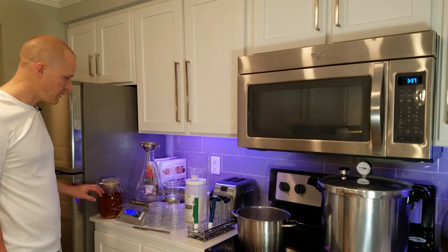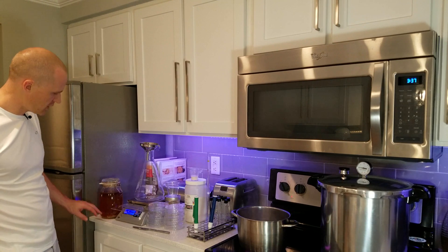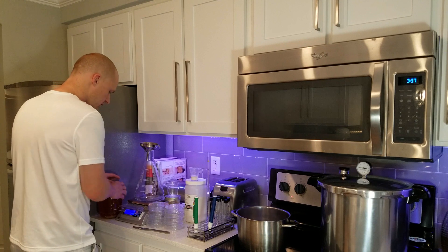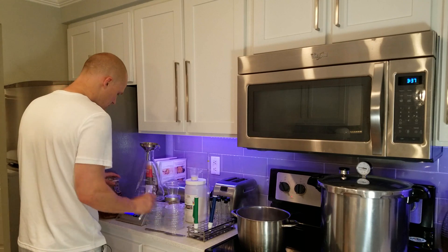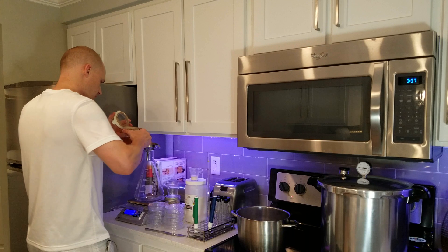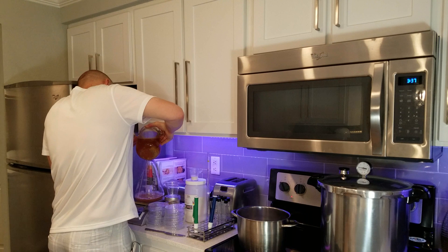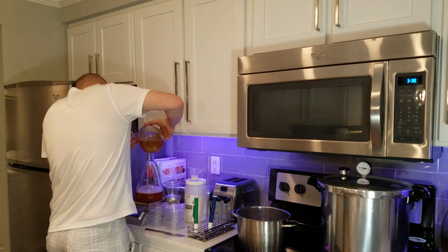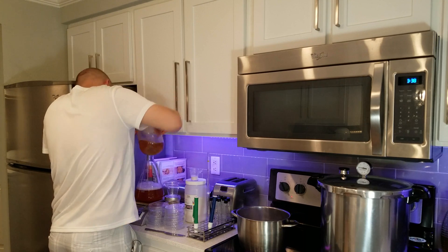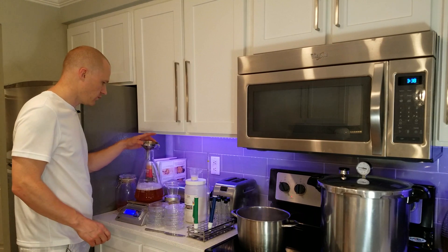You want to filter out the hot break from your starter so it does not go into this recipe. It's pretty much fallen down to the bottom, so I'm just going to pour carefully. I'm going to pour one liter of this starter into my Erlenmeyer flask. I made a little bit of a mess, but okay — we have one liter of that in there.